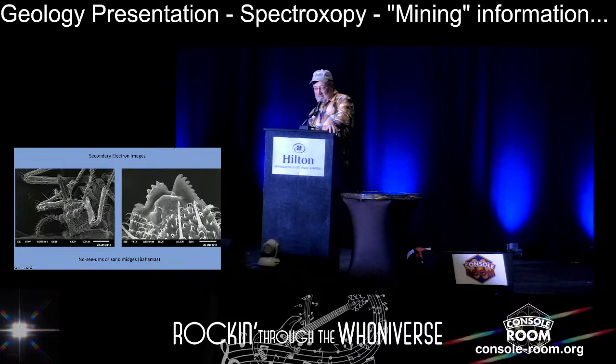And then inject you with the stuff. We had some students that were just completely covered in bites, because it was so hot at night they wouldn't cover up. The simple way around it, bug spray, didn't work very well. But if you wore pants, you were fine. But it's kind of amazing, that level of detail that we see on this functional organism that is less than a couple of millimeters across. That picture on the right is magnified about 4,300 times. And the scale bar, you probably can't read that, but that's a tenth of a micron. Actually, no, that's 5 microns on the right side.